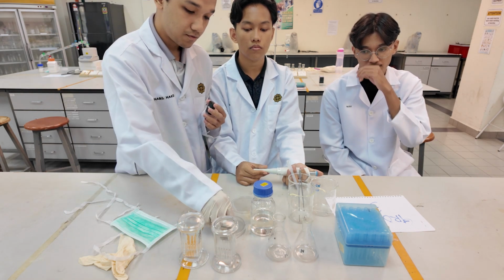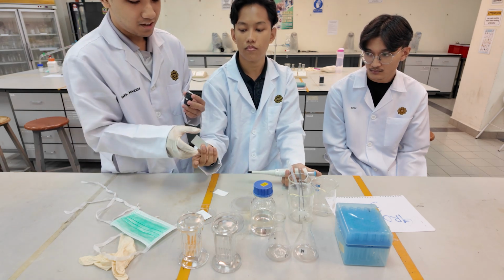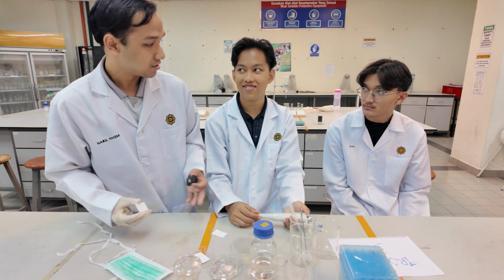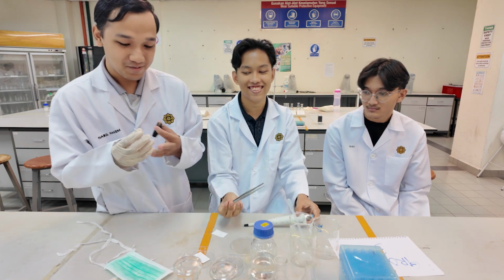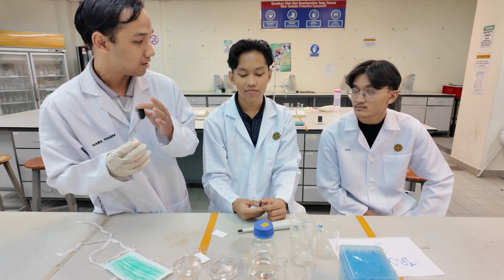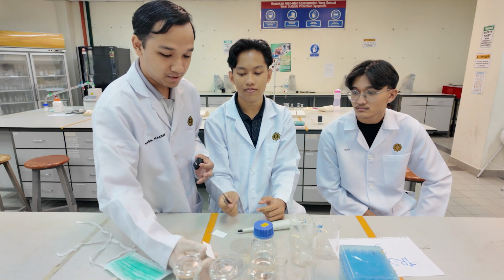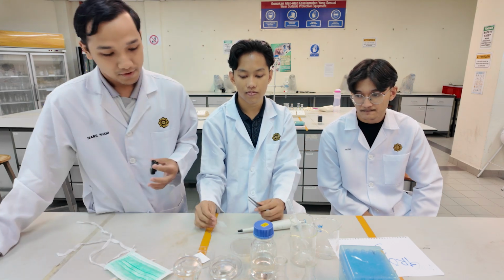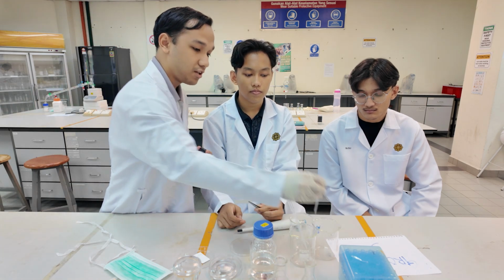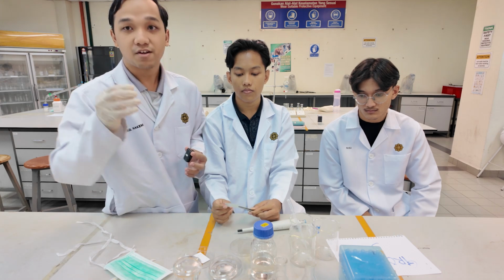Then for the TLC plate, I want to talk about how we should protect the surface. We don't want to make a contaminated TLC plate. And for spotting, we need to use a clean and different capillary tube to prevent cross contamination also.